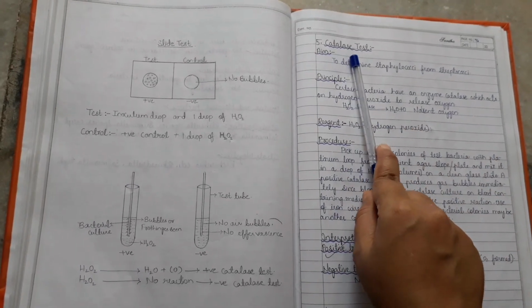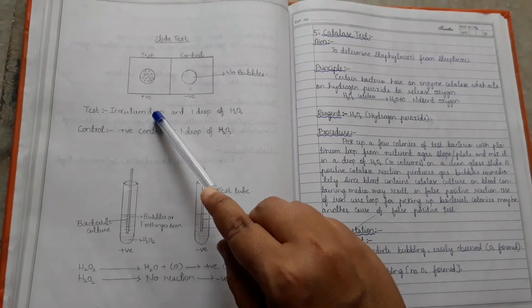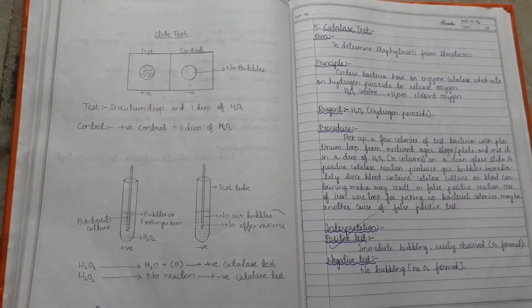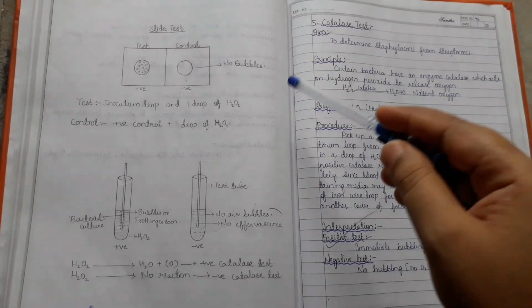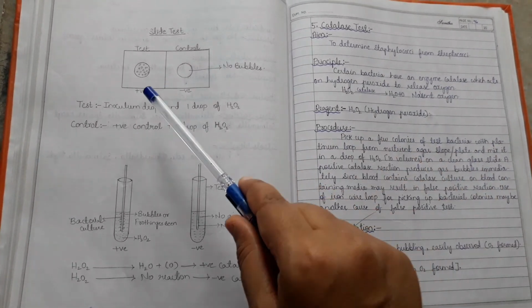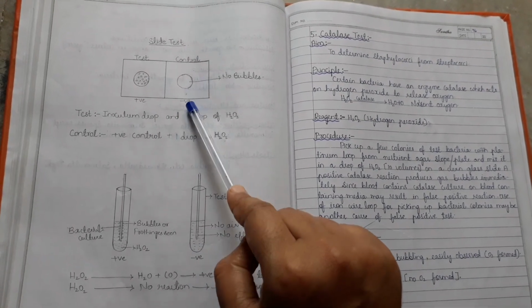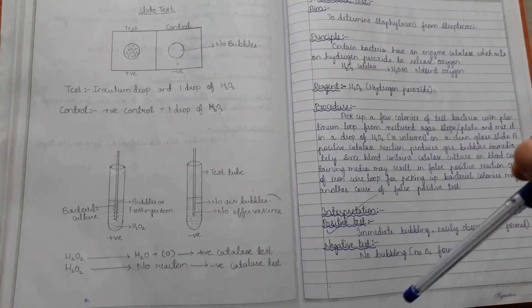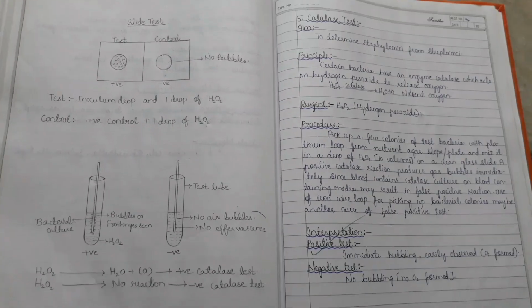So the fifth one is the catalase test. Here is the slide test. So inoculum drop plus 1 drop of hydrogen peroxide. Presence of bubbles shows positive and no bubbles is negative.